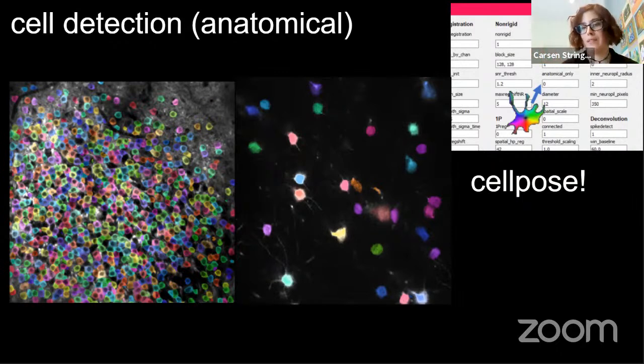It's not online processing, unfortunately, but the hope in our experiments is you do a recording that's a few hundred gigs, you process that recording, and then a few hours later you can say, oh, I want to change my experimental setup. We really want people to be in the loop with the analysis, and that's our goal with Suite2P: to make it easy to run it quickly so that you can come back and change your stimuli or your behavior depending on what kinds of signals you see.